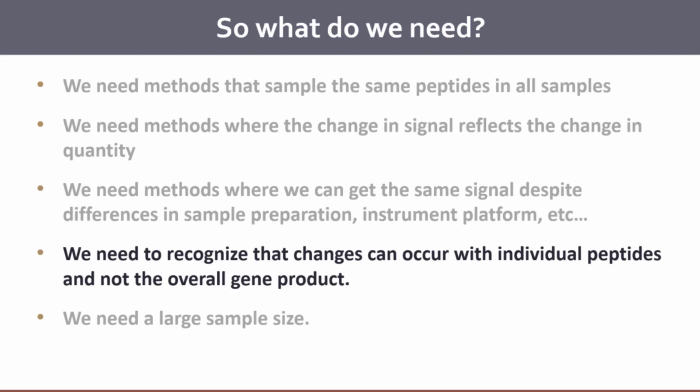They kind of get this, that a lot of people try to report values on the protein level, right? So every protein has a number, and they try to report the outcome of the values as a protein measurement. Every time we try to do that, we've often missed the most important things that are often known to be involved in the sample. And I'll try to explain why I think this is a problem, and why I think it's actually hard with a bottom-up proteomics experiment to report a protein level.